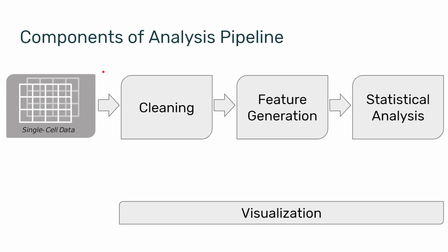And an analysis pipeline is not something new. In fact, it has existed since statistics existed. And you can talk about these steps in the 40s and the 50s. It has garnered some more attention due to data science. However, once again, it is not new to data science either. So the steps I'm showing you here are not an invention of computational biology. They have a pretty long pedigree.